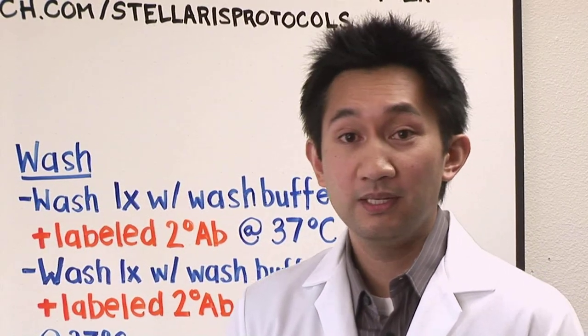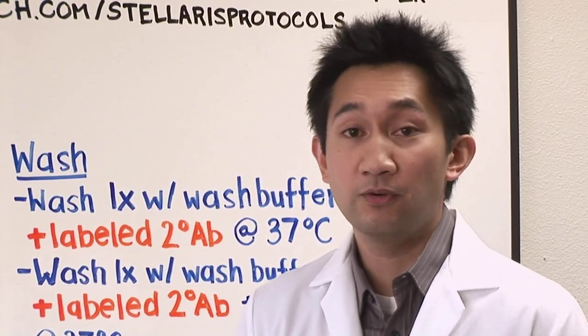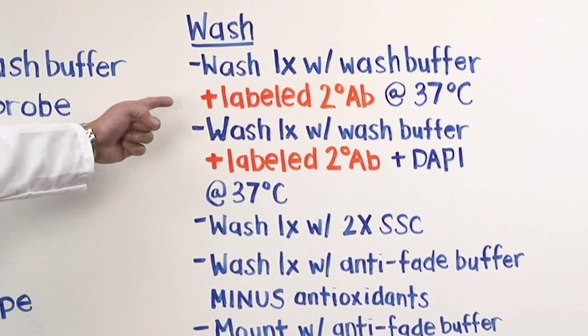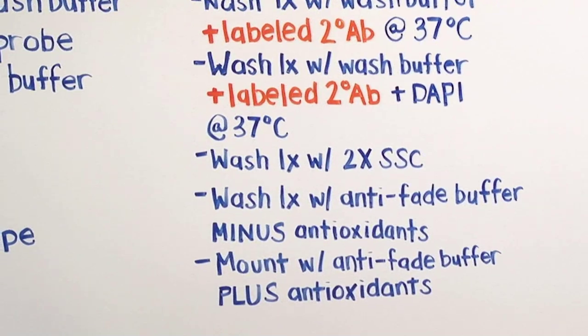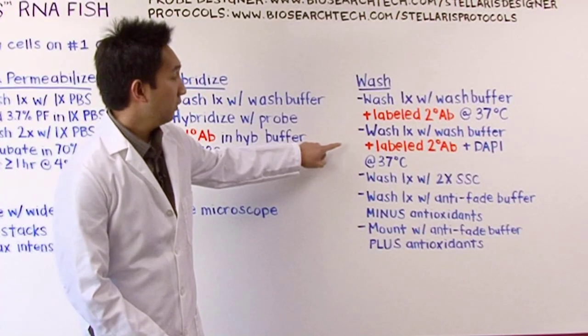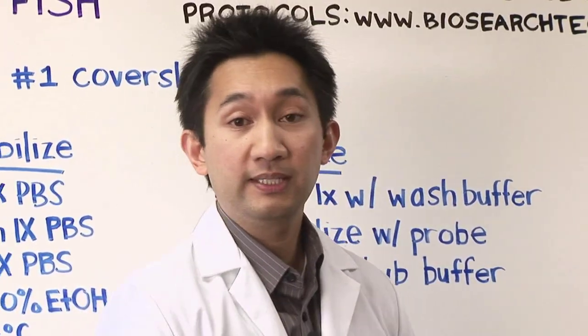Now in this experiment, we'll be doing an overnight incubation at 37 degrees, which you can do in as little as 4 hours. The third step is the wash step. Now this is important because it'll remove any unbound Stellaris FISH probes and excess unlabeled primary antibody. Now the wash will be done with the labeled secondary antibody for about 30 minutes at 37 degrees, and a second wash step with, again, the labeled secondary antibody plus DAPI now for nuclear counterstaining.